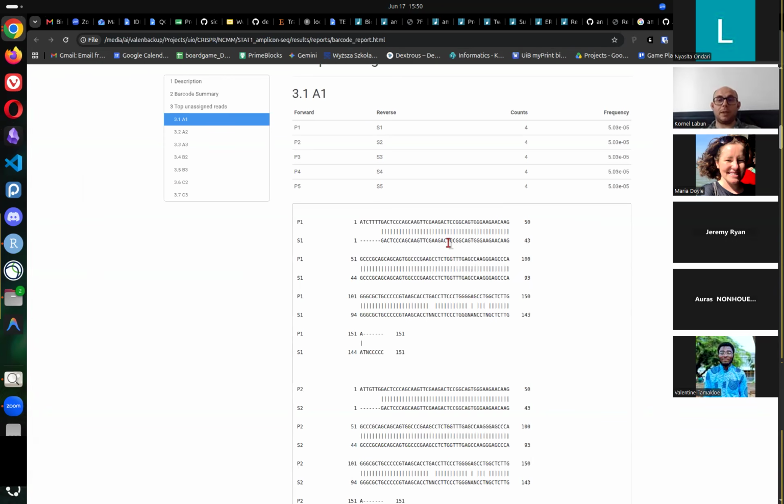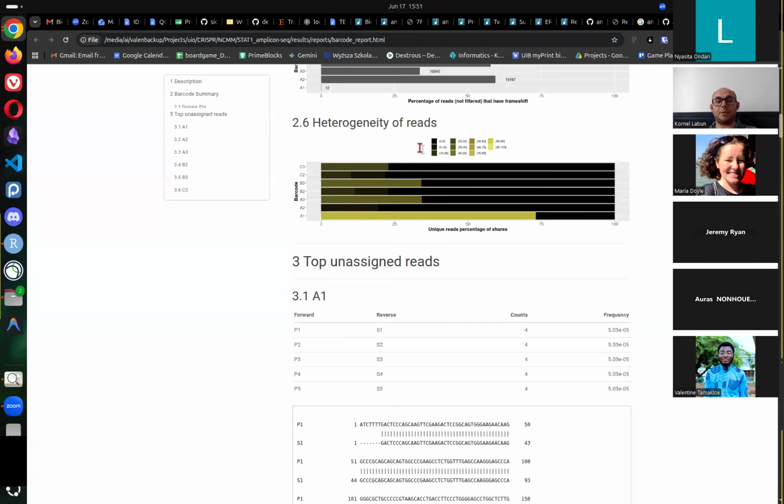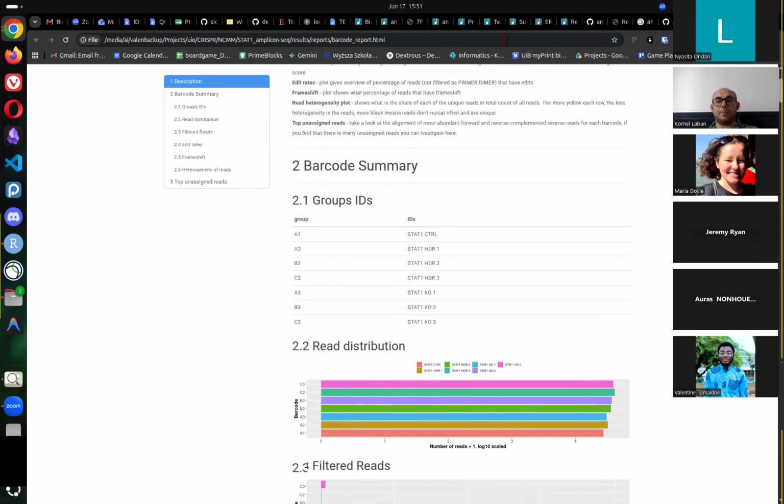This shows you, because these reads are not assigned anywhere, I don't know which amplicon to align them to. So I align just read forward and reverse, and you can see that there are many reads like that. In this case, it is almost nothing. So almost everything was nicely multiplexed, right? Because we had very clear cases. All reads belong to this single sample and so on.